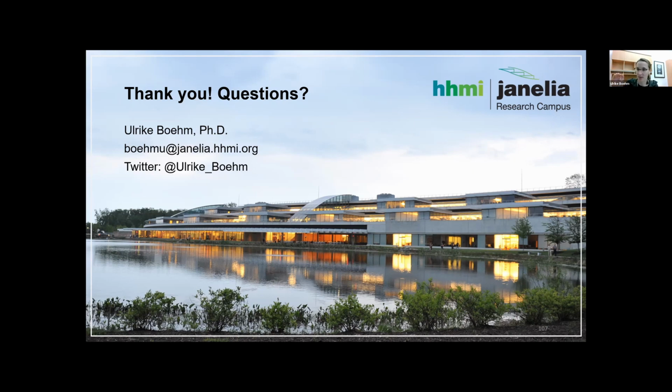I hear you, I know what you mean. So you aim for the best thing. And I think that's also the case, for example, with this one buffer which was displayed, where you also have long-term stability. But still, when I do experiments, I'm always on the more cautious side. Things can be said to be stable, but I always start with fresh ingredients just to be on the safe side. I don't know if that was a satisfying response, but there are things which are stable out there.